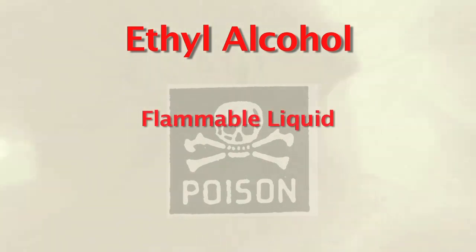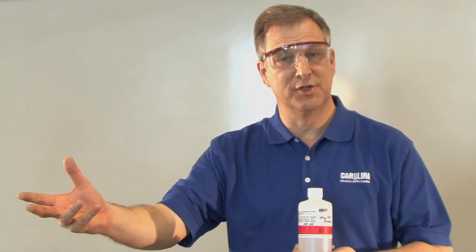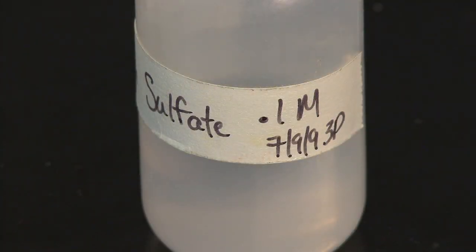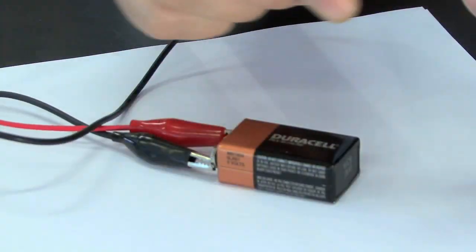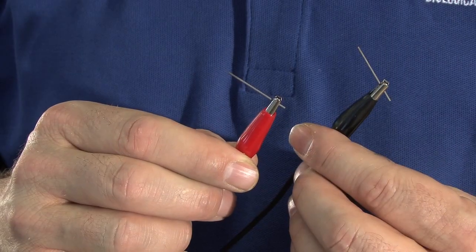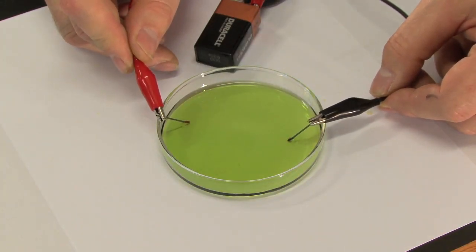Safety for this: ethyl alcohol is a flammable liquid. It's also toxic by ingestion and inhalation. Make sure there are no flames or hot surfaces anywhere around when doing this demonstration. We also want to make sure that we have good ventilation in the lab and that we do not ingest this — after we're done, it goes back into the store room. Next, I'm going to add just a small amount of sodium sulfate. I need some ions in here to help conduct the charge. I'm going to bring my 9-volt battery — I have two pieces of pencil lead attached to the alligator clips — and I'm going to put these into the petri dish. Let's just watch.